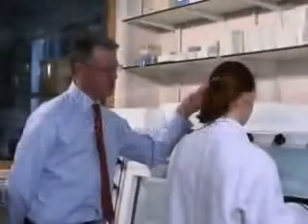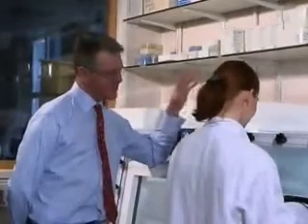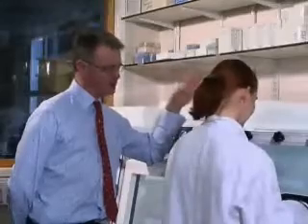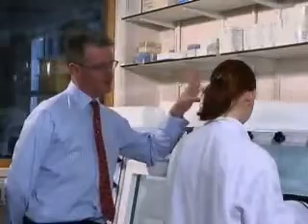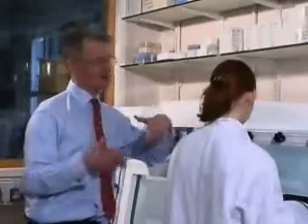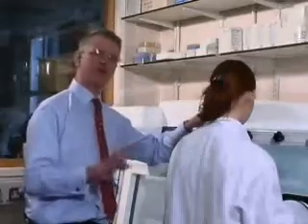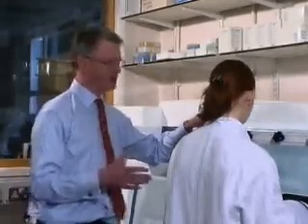What we're interested in is what cells do when you lower the amount of oxygen. And we're interested in the basic switch that they use to tell how much oxygen's there. And that switch actually operates extremely quickly. And what we found was that if we had cells in an incubator and we took them out, then during the time that you're breaking the cells up and extracting the proteins, they've already made the change to the proteins because it all happened so quickly.